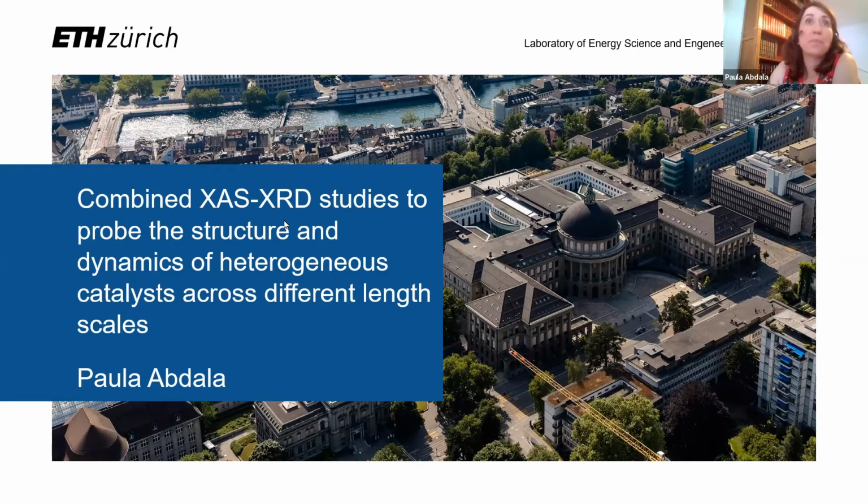So I will present a series of studies on combined X-ray absorption and X-ray powder diffraction to investigate the structure of a catalyst across different length scales, ranging from the local structure to a longer range order.